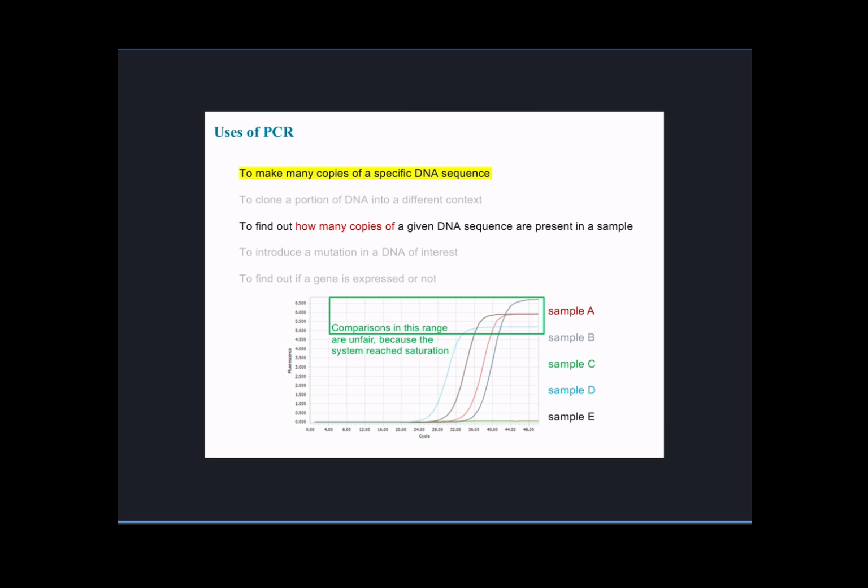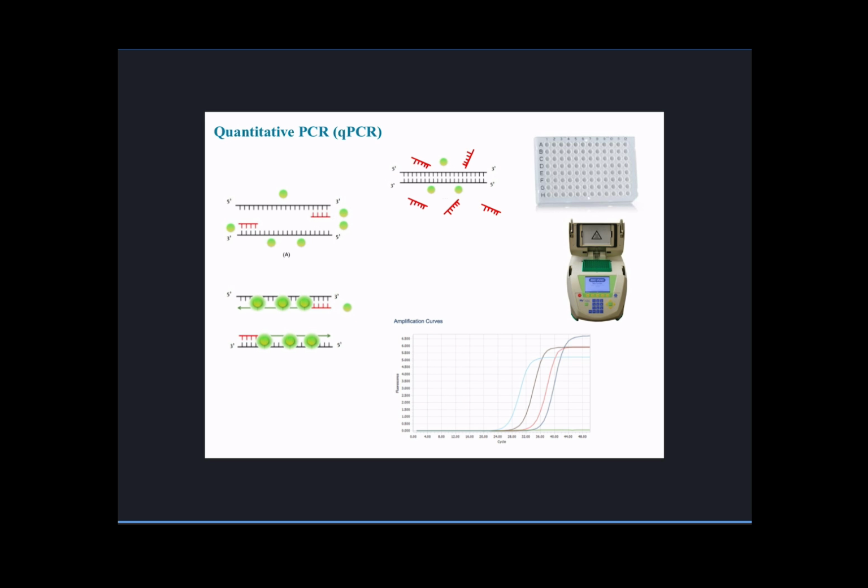That's why we invented what is called qPCR, quantitative PCR, or other times you'll see it referred to as real-time PCR. I don't like that name, because the acronym of that is RT-PCR, and as we will see in a couple of slides, we use RT for something else. So qPCR, fortunately, is a little more popular.